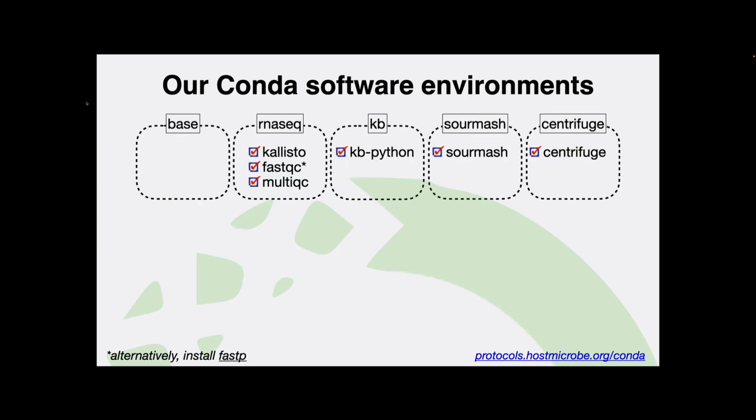Now, this notion of using Conda to create Conda environments was really central in the first lecture, and it's going to be really important in this lecture because we'll be firing up one of those Conda environments to actually access the software that we'll use for doing our RNA-seq read mapping. And so I want to take just a minute to talk about Conda and hopefully what we've all accomplished with respect to creating environments. When we installed Miniconda 3, we got a base environment for free, if you will.